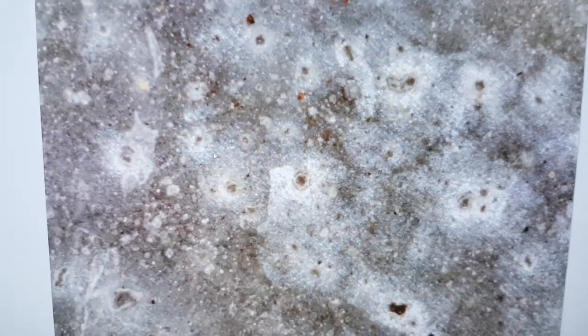I'm going to take you through a few images. That's a close-up of what you've just seen. I'll share these images with the video description. Here's one with the polarizing on.